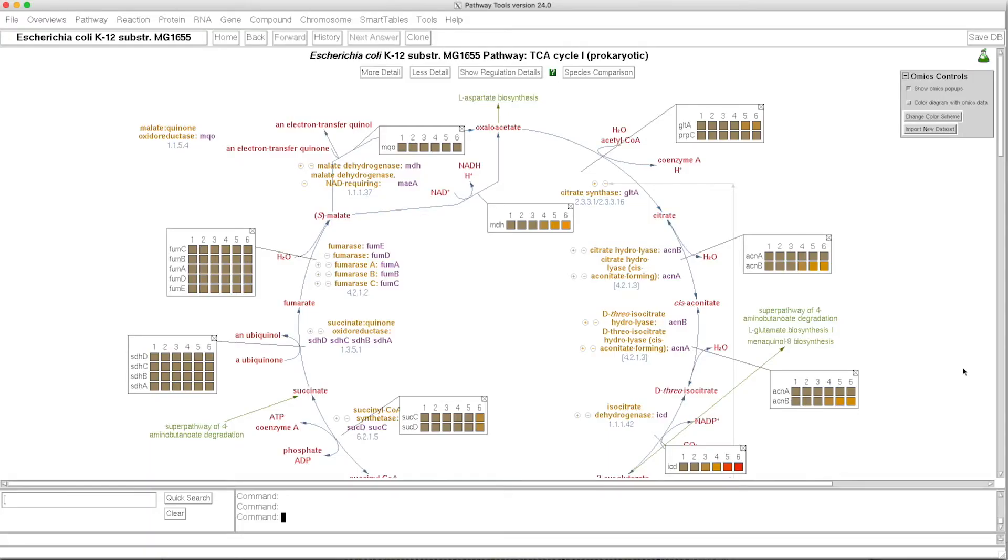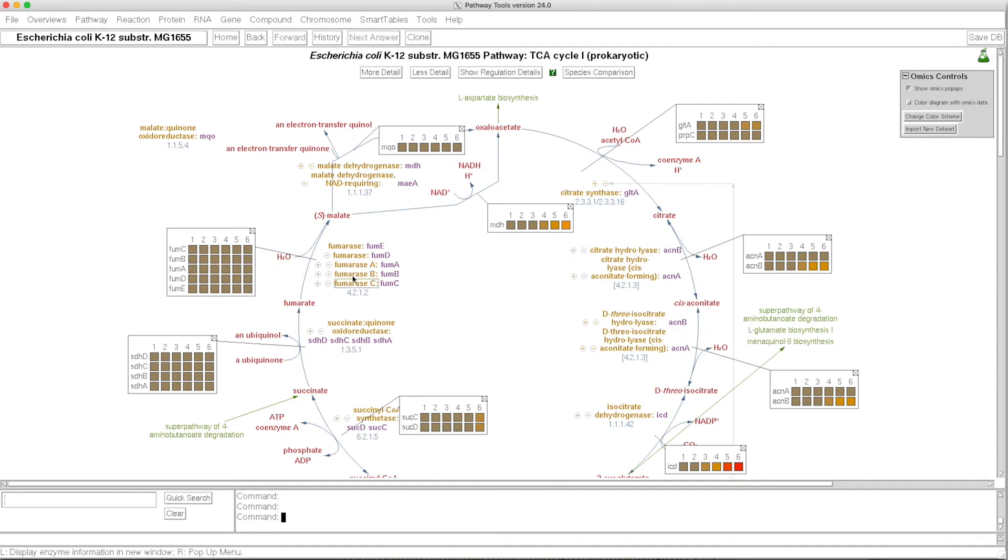We can also show an individual pathway, and the omics data will be shown using these omics popups, which let us see very clearly that some enzymes in the TCA cycle are not changing their expression very much at all, whereas other enzymes are changing quite significantly.